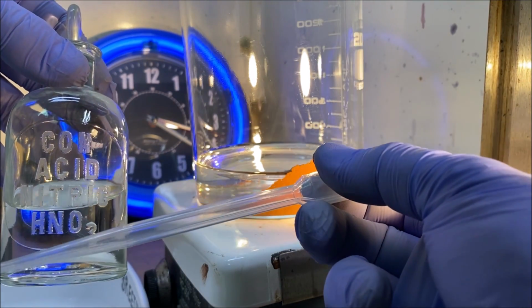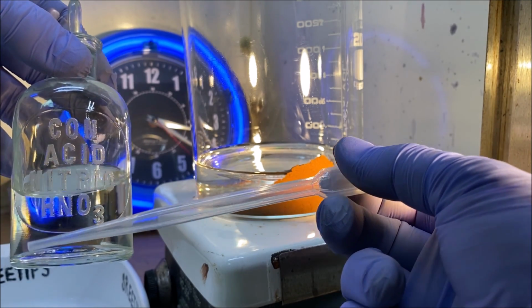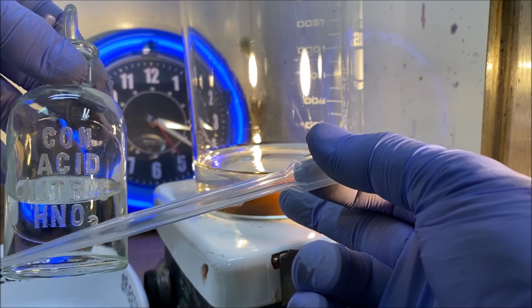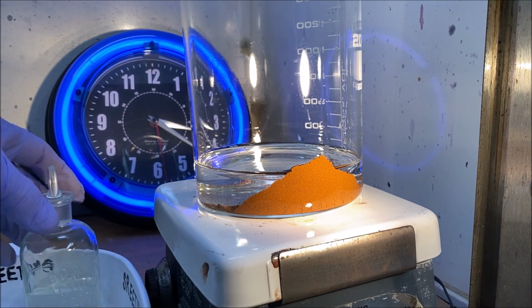And I'm going to start adding small doses of nitric acid. And we're going to redissolve this gold a second time. I'm going to do that with a time lapse. Here we go.